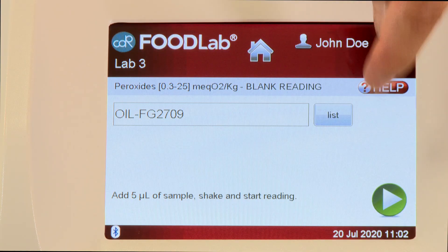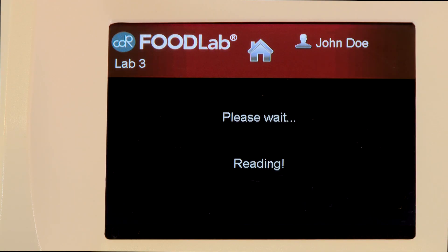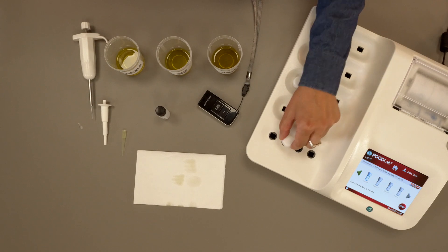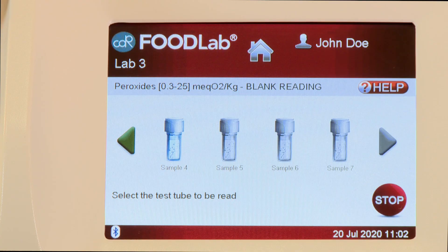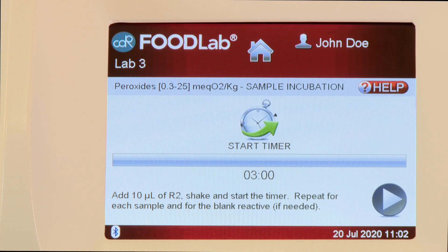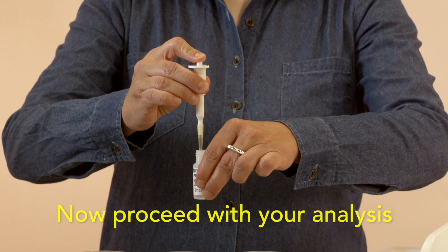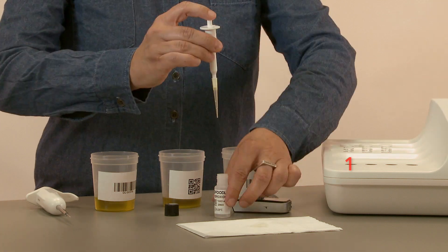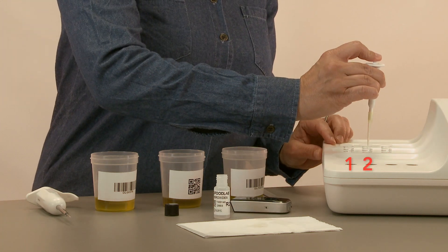Then press Next to start the blank reading. At the end of the reading, place the third test tube back in the incubation cell. Then press Stop to terminate the reading session. Repeat the procedure of withdrawal and release for all samples.